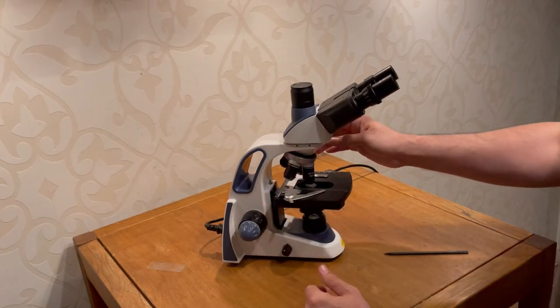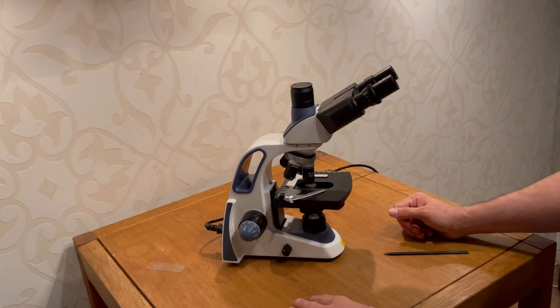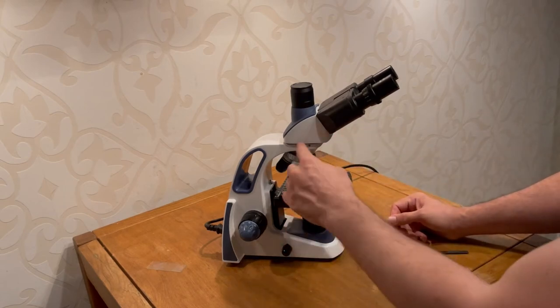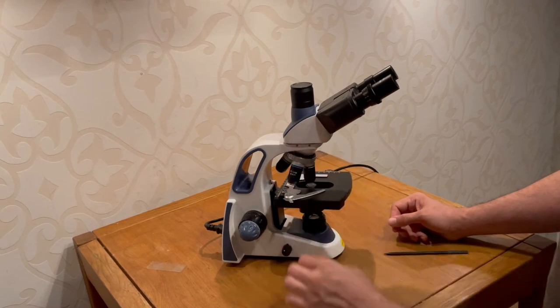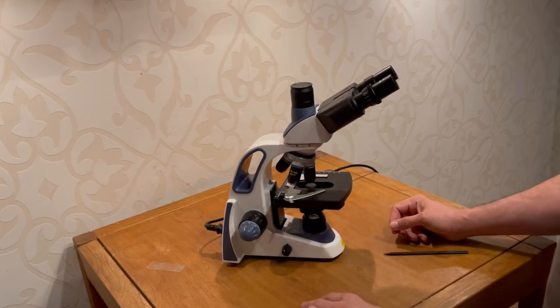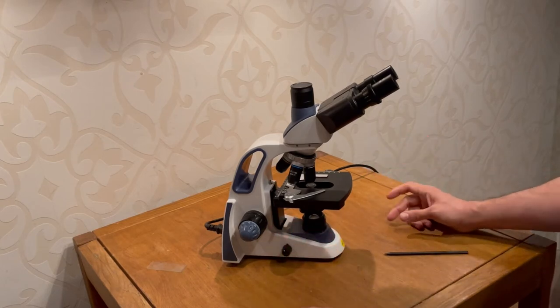So what I had to do, I had to tighten it up. But I don't think this is good. And actually when I do this, over time it gets kind of loose. So I think you have to use some thread locker on the little nut inside there that holds this black circle. That's one of the defects. It's not a big one, but it's a bit unpleasant.